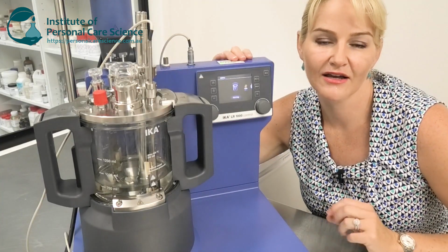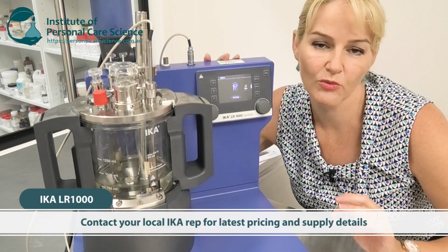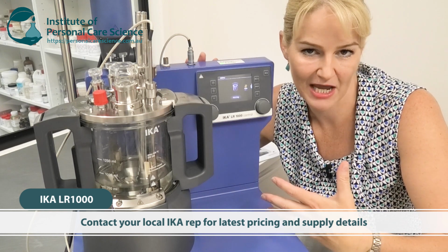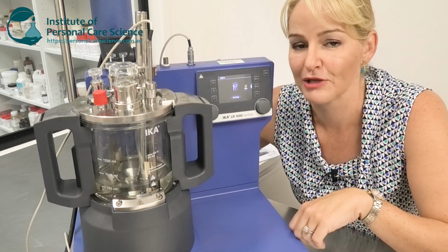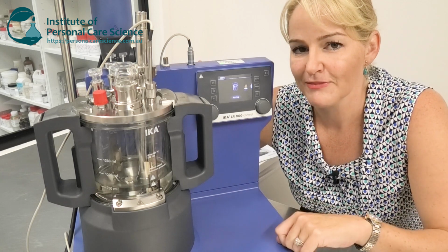This is the IKA LR1000 here. Now this is an amazing piece of lab equipment. It will help me replicate what would be a scale up step using laboratory sized equipment. So I'd make my lab sample in a 100 or 200 gram sample. We sign that off, and then our next step is to make a large lab sample.